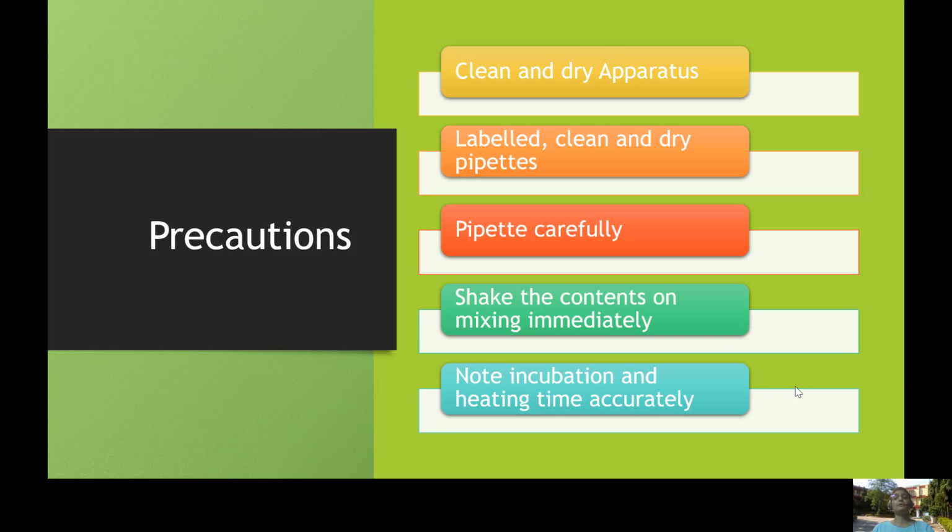So now we will do this experiment in the lab and see how the experiment comes out to be, and we will find out what is the activity of our sample.